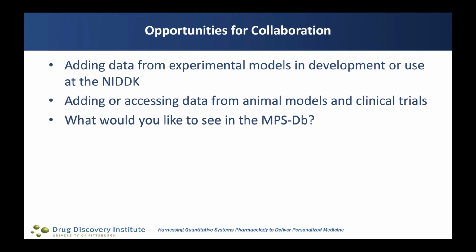For the studies, we do have the ability to create a set of studies, and I didn't show that feature, but what you can do is take any combination of study data that you've generated in the database, and combine that under a single URL that gets assigned as a unique locator for that combination of study data.